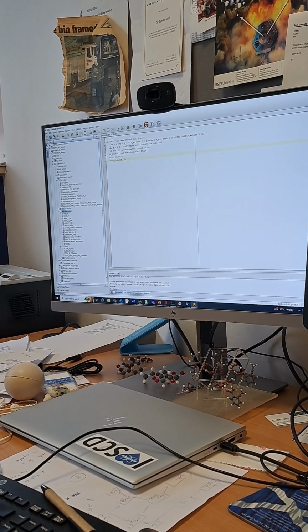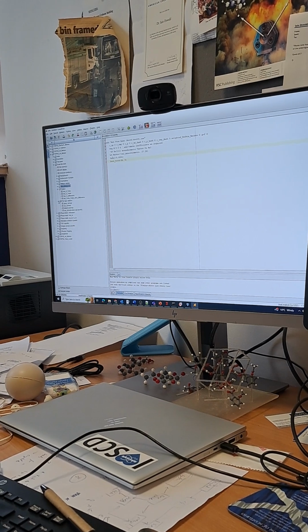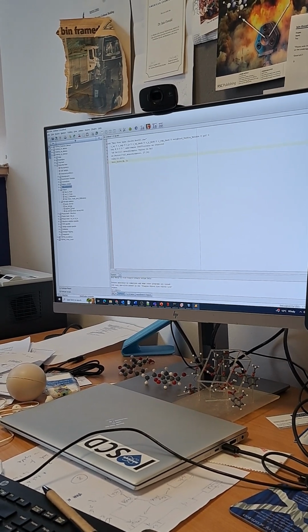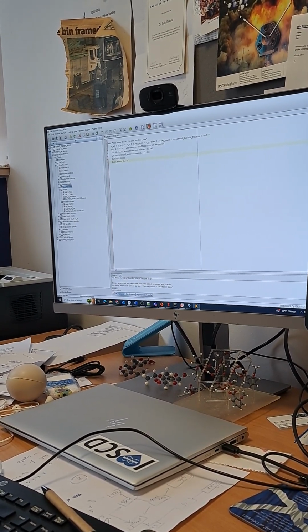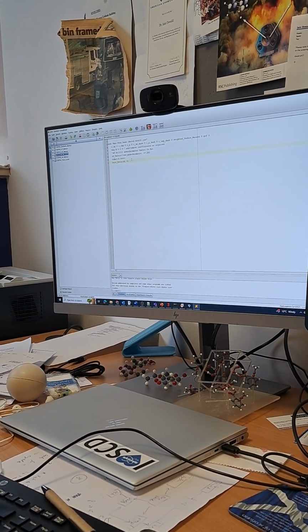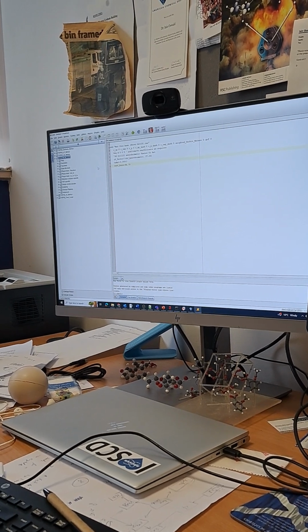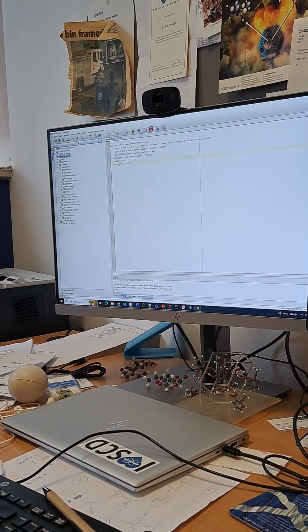We can then output if we want to, but we're not wanting to do that at the moment. And file type extensions is fine. So we're just going to leave it all as that. And that is the scan level bit.